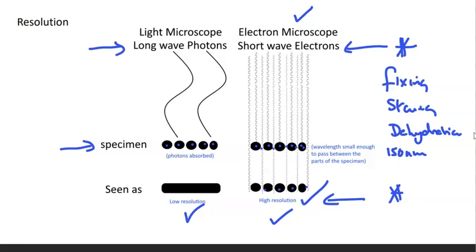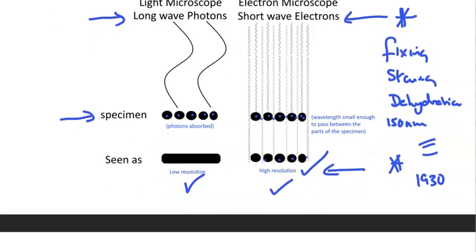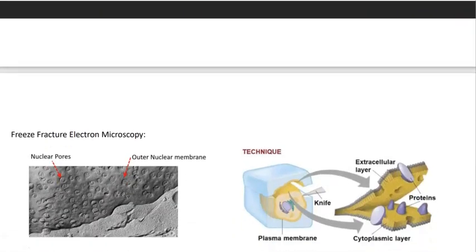And these techniques are highly skilled, and electron microscopy is an entire branch of science in and of itself. So the traditional methods of preparation were created back in the late 1930s, and of course have been enhanced greatly over time.